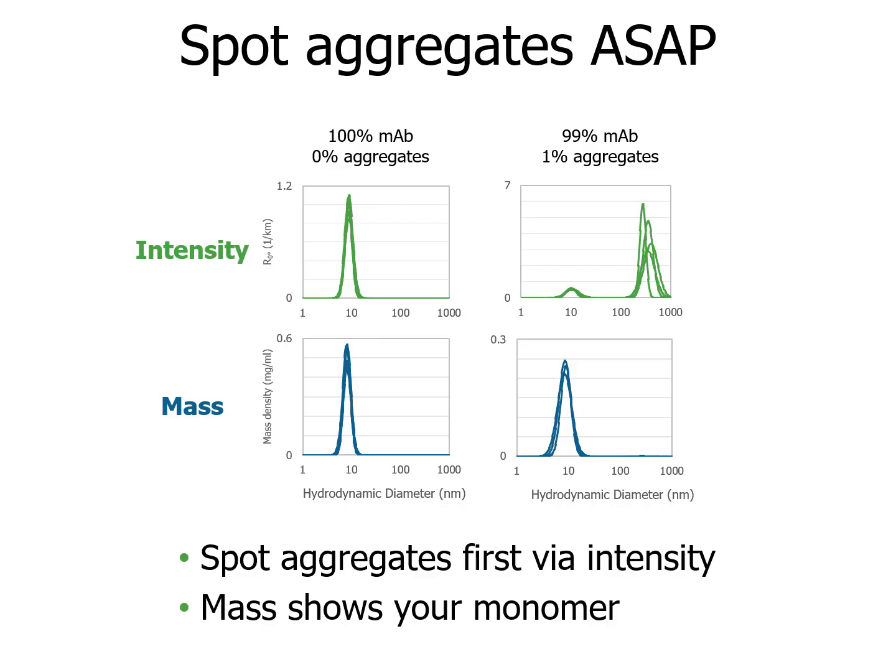If we want to apply those two principles to an actual real-world use case, we can think about the need to spot aggregation in a protein sample. DLS is one of the most rapid ways we can use to detect aggregation, but it's also one of the most sensitive to larger aggregates.